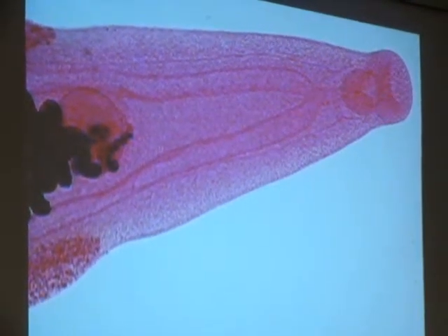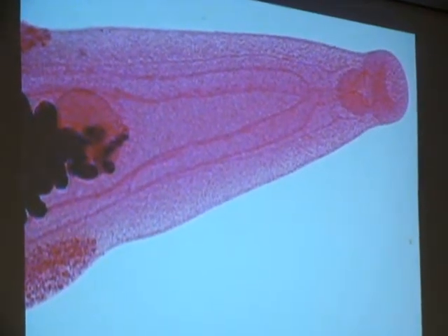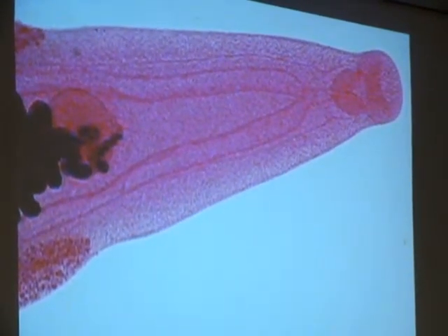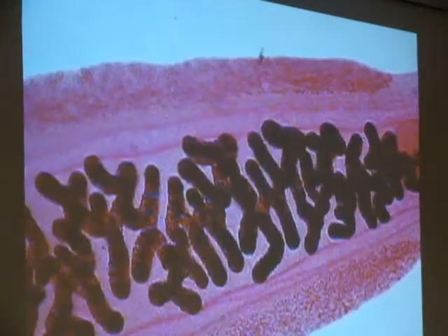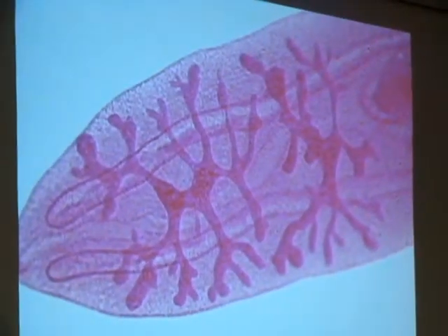Now again, remember your multiple choice. Crura just means it's forked or split. Don't let that goof you up. So you can cue in on intestine. This one's got so many. What's the black coil? Uterus. Pink antlers, testes.